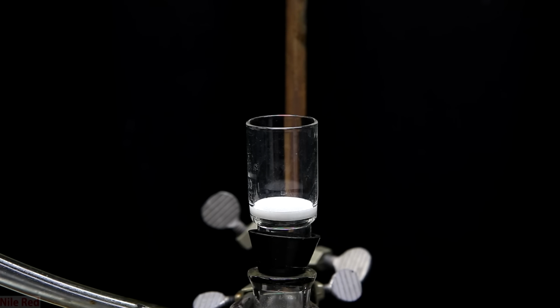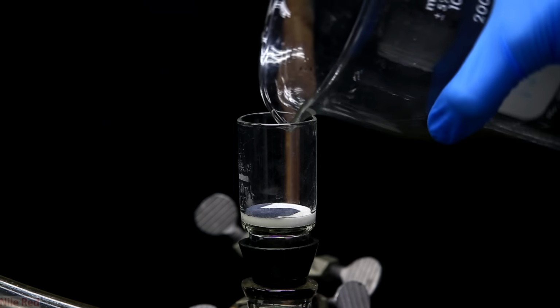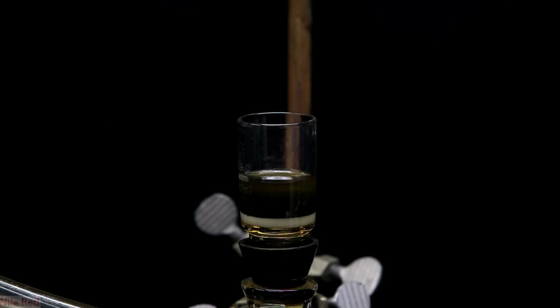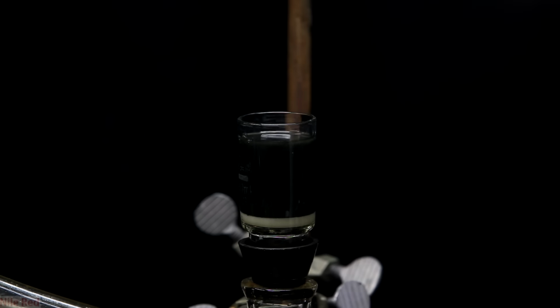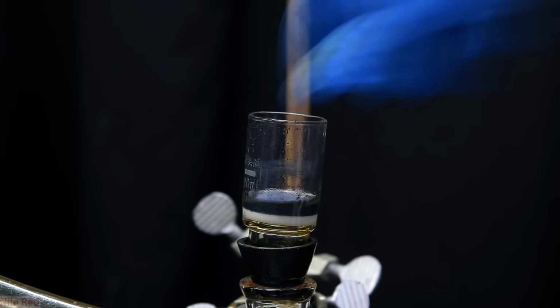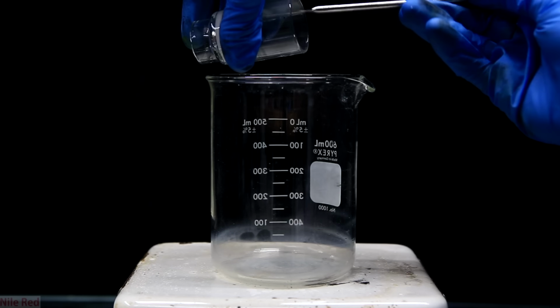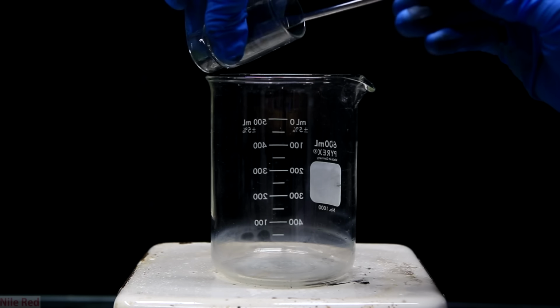This iodine was then vacuum filtered off. I opted to vacuum filter it, but it's just as viable to gravity filter it using something like a coffee filter. After everything was filtered, the iodine was washed with a little bit of water, and the vacuum was kept on to dry the iodine a little. Once the iodine was relatively dry, it was scraped off into a beaker.